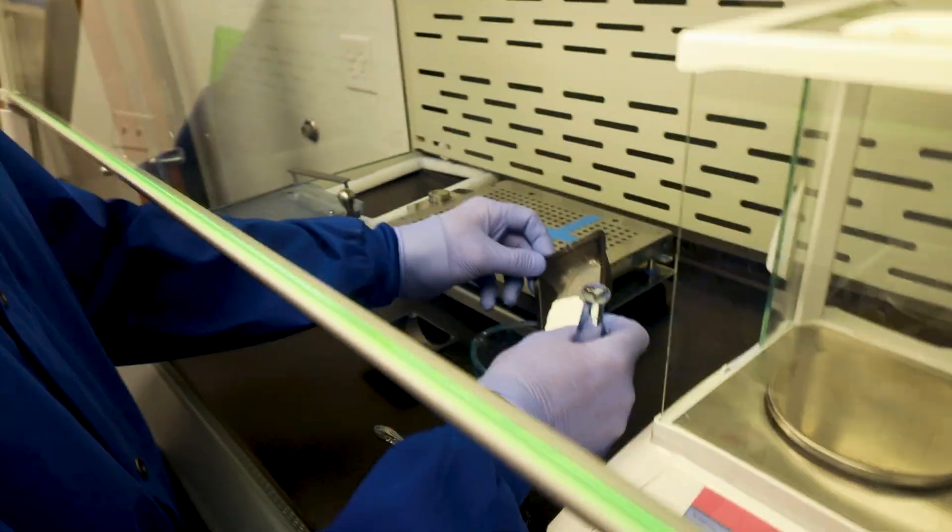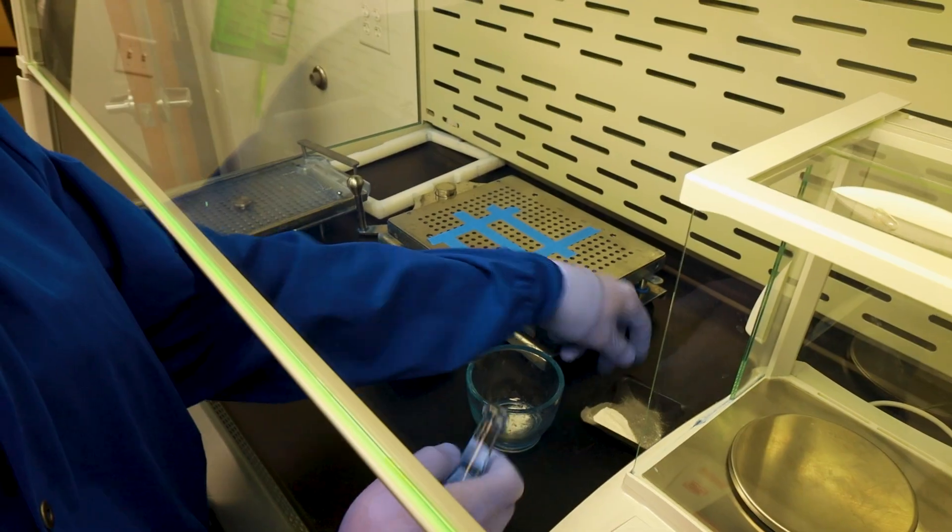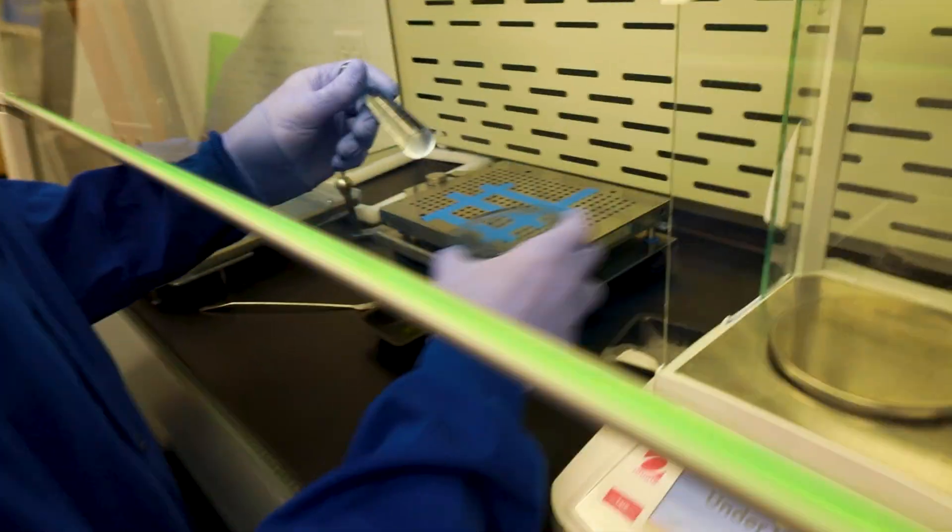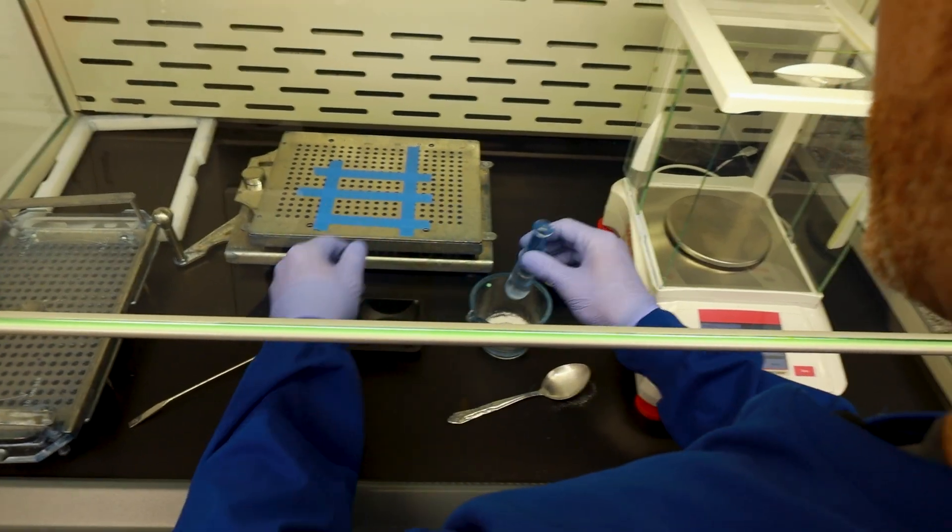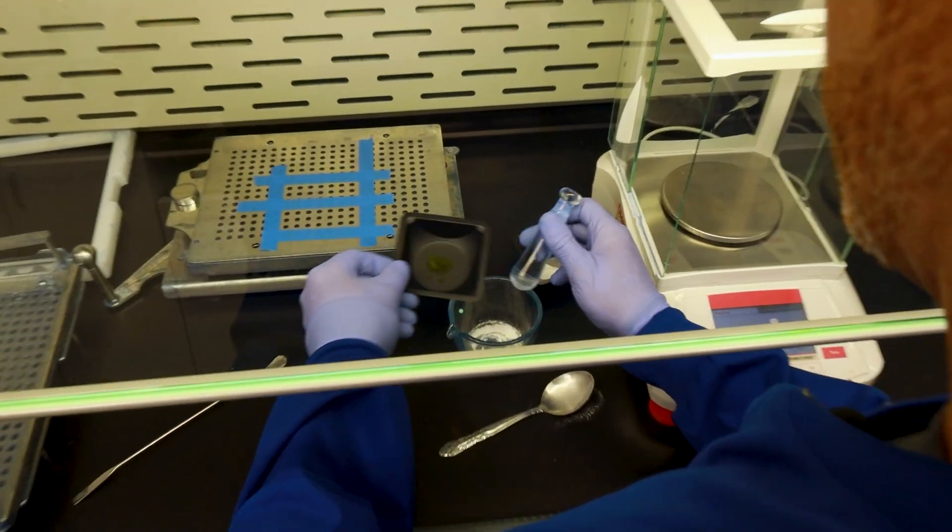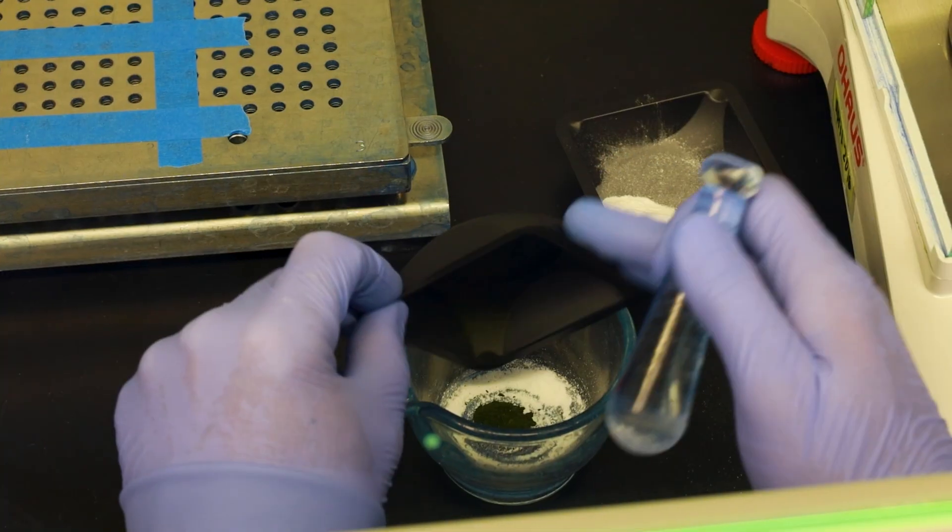So when you're mixing this up the old-fashioned way, which is what I'm doing, you want to put a little bit of your base powder in your mortar so that you fill up those cracks and your API, your methylene blue, does not get in there and you lose some of your drug.